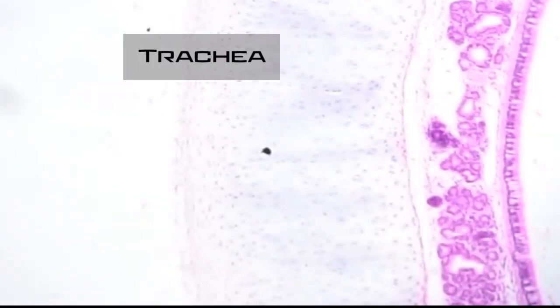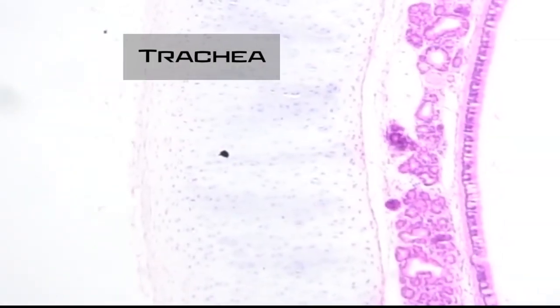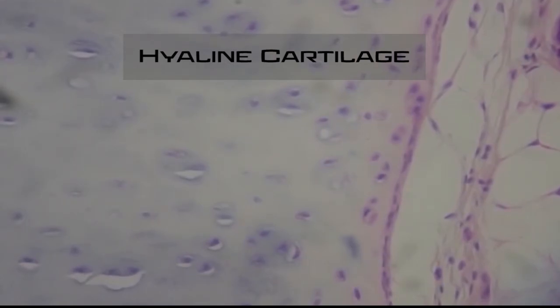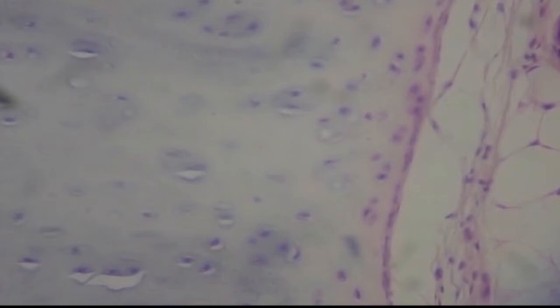To see the next connective tissue, we are going to go back to the trachea slide, where we saw the pseudostratified ciliated columnar epithelial tissue. So if we zoom in more superficially than that, we will see this connective tissue, which is known as hyaline cartilage. Hyaline cartilage is unique compared to other connective tissue because the extracellular matrix is made out of a dense mesh of collagen fibers, which creates this kind of glass-looking appearance for the extracellular matrix.